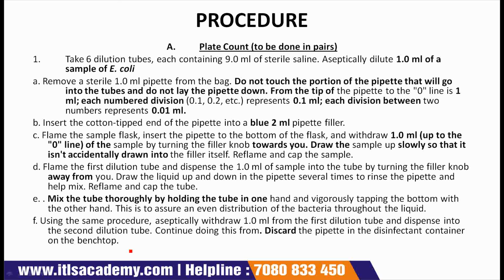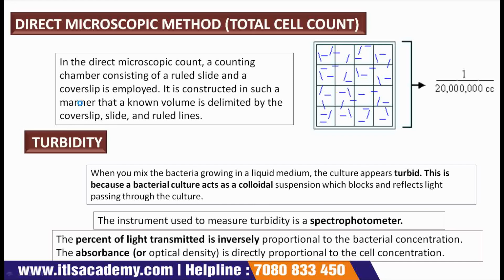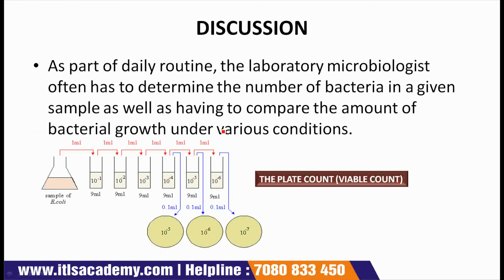Although we have also seen this whole procedure in our previous slide, I can show you. This is the process that we are discussing in point 1. You just have to take your pipette, dip it into the sample and take 1 ml, transfer it in this tube and then this process goes on.